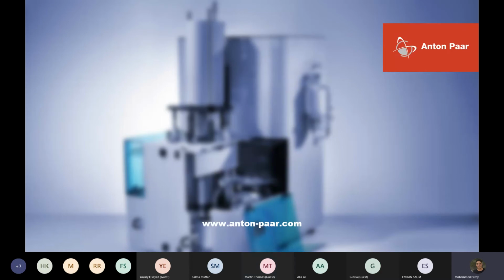At that point, when you take the penetrometer out of the low pressure station, the operator should insert what we call a blanking rod, which closes off the low pressure station so that there's no chance of mercury vapor coming back out of it.